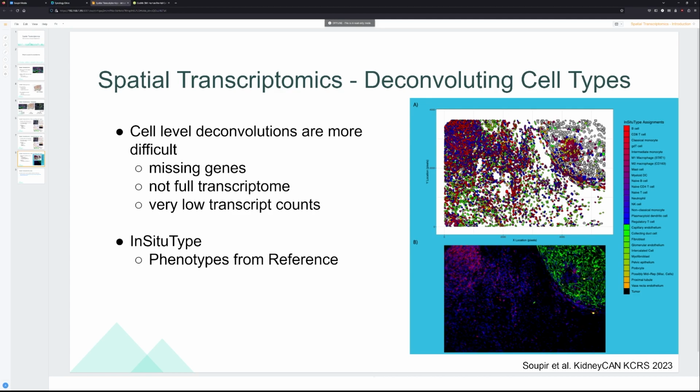And we have this pocket of immune inflammation happening here. And that kind of matches up with what we see down here on the bottom. We have our tumor down here with the green. We have our immune inside that with the dark purple. And then over here on the left-hand side, we have far more immune, which is pretty cool. So this is one of the tools that we'll be using here because it's free, and we can download one of the cell atlases in order to deconvolve our example data.